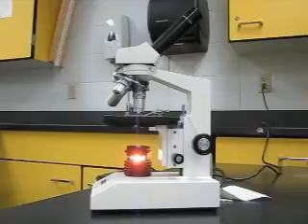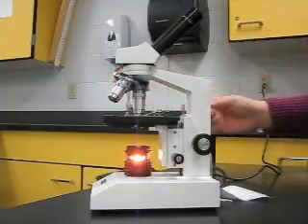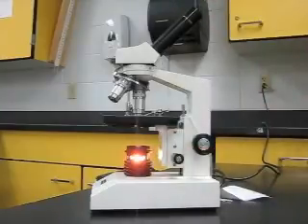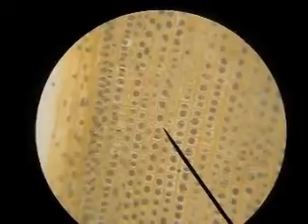Once your specimen is in focus on the 10x, you can move the revolving objectives and move up to a higher power. In this case, we're going to be looking at the 40x. This clip is an example of what your specimen would look like through the 40x objective.